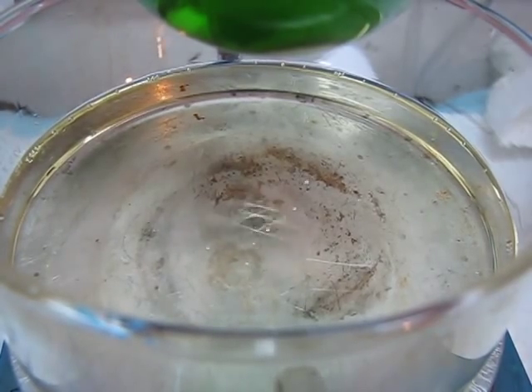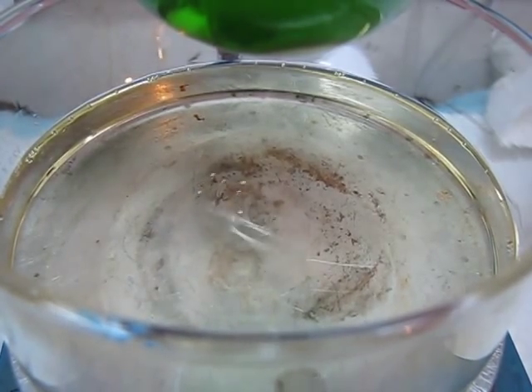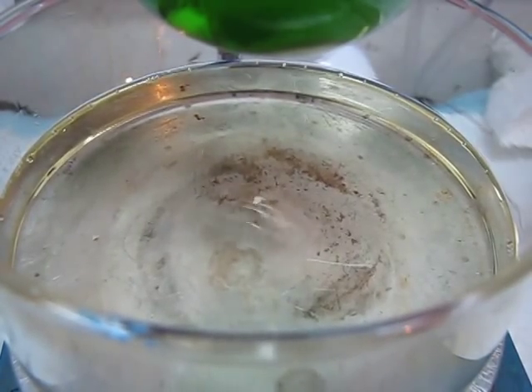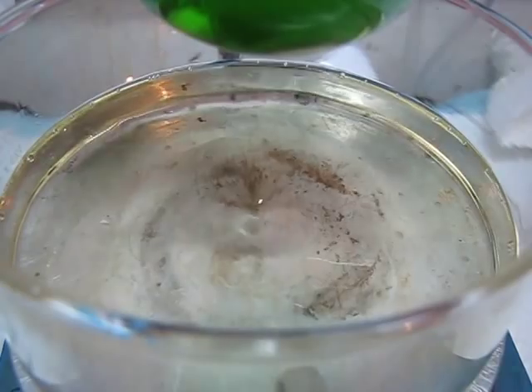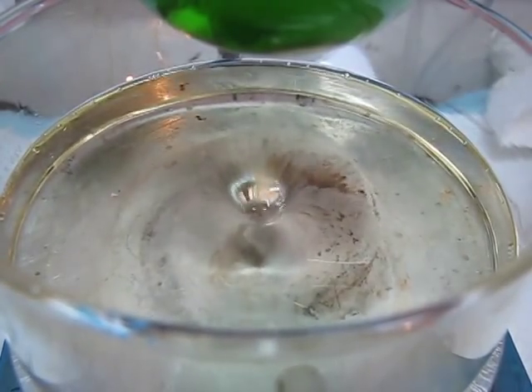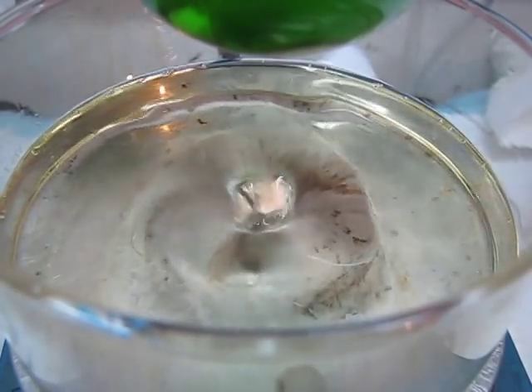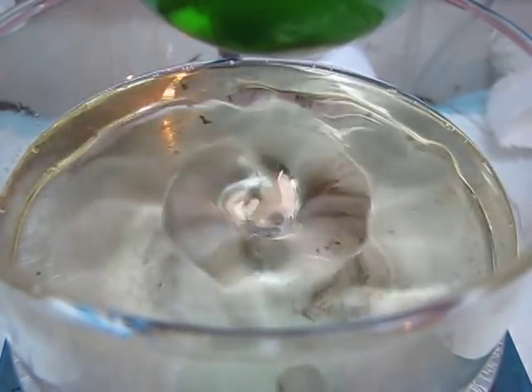No muss, no fuss, no hazard. If you sit your flask on top of it, the worst that could happen is you scratch the glass a little bit. And, surprisingly, you can actually get a good vortex using this stir bar — and this isn't even all the way up.